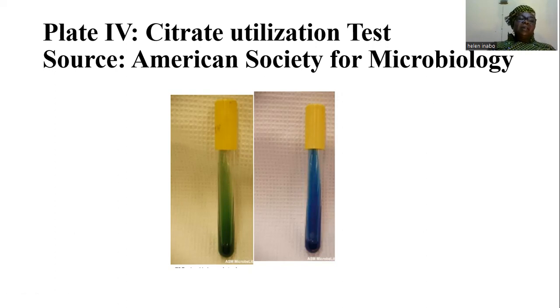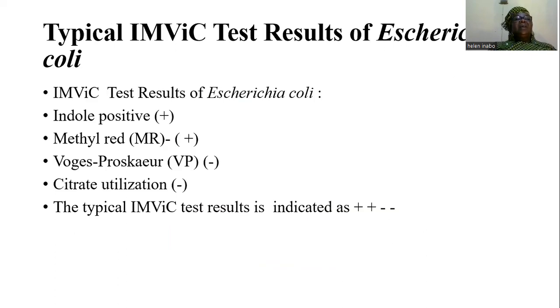So E. coli is negative for the citrate utilization test.